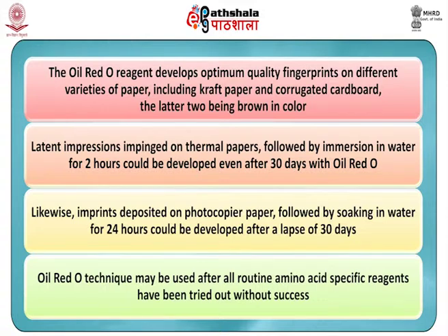Likewise, imprints deposited on photocopier paper followed by soaking in water for 24 hours could be developed after a lapse of 30 days.